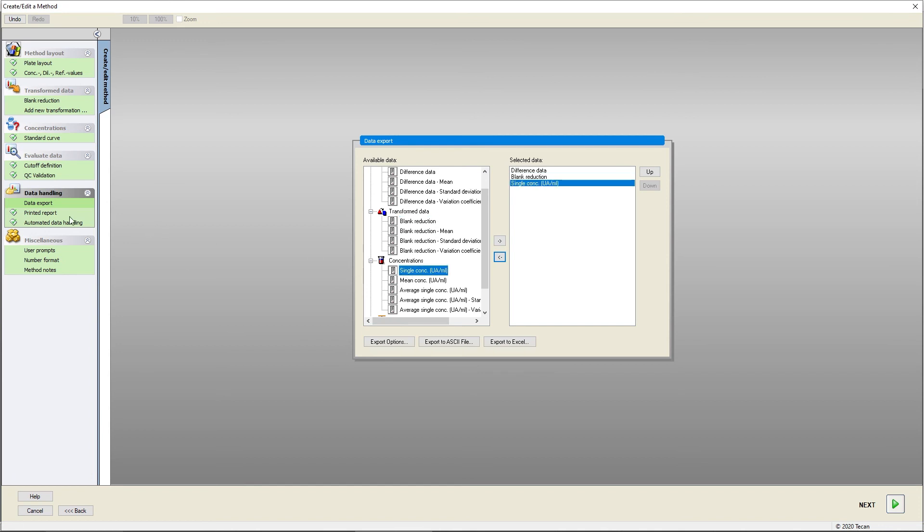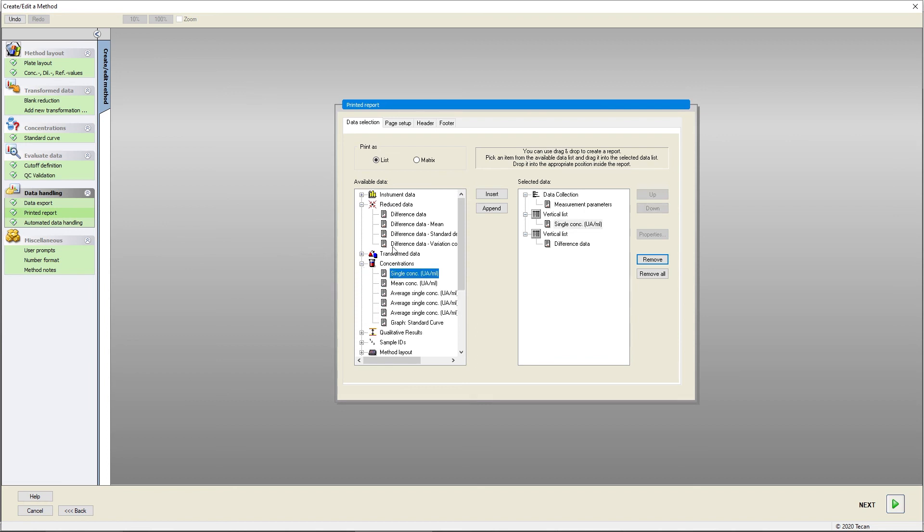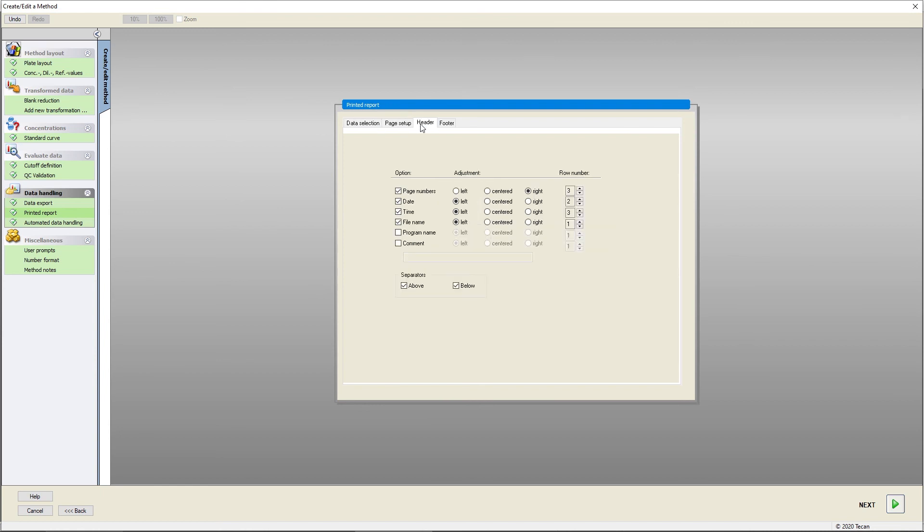To create a printed report, choose the format and selected data, and customize its display using the tabs page setup, header, and footer.